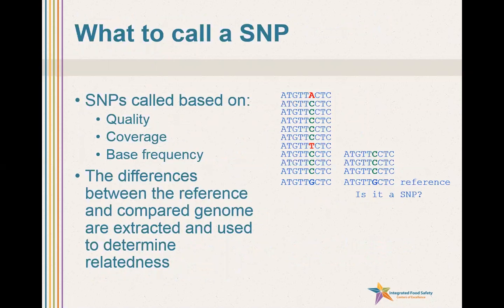If we have 20x coverage, we can apply a criterion saying we're only going to call something a certain nucleotide if 19 out of the 20 repeats agree. So we see this on the left. On the right side, on the bottom, we see a reference sequence. On the top, we see multiple coverage of the same site. And one of them you can see we have a lot of sequences. Once it's an A, once it's a T, and all the other 8 times it's a C.